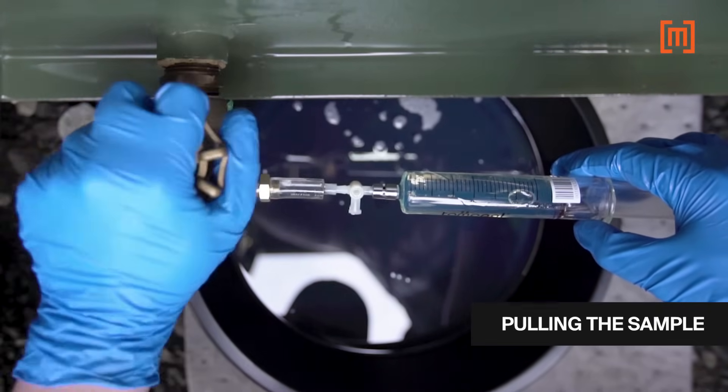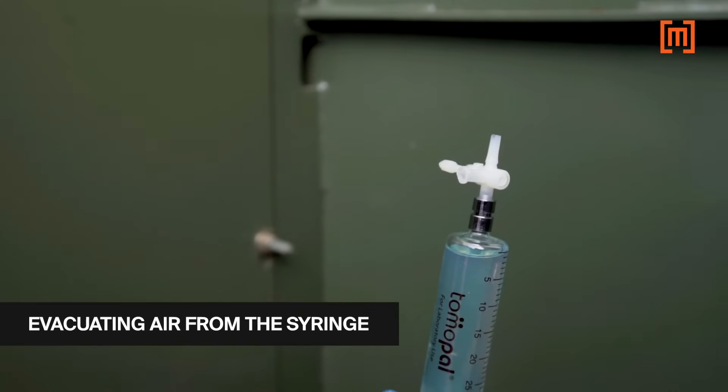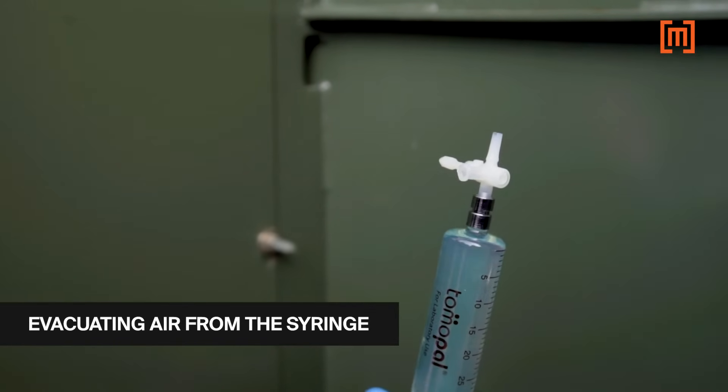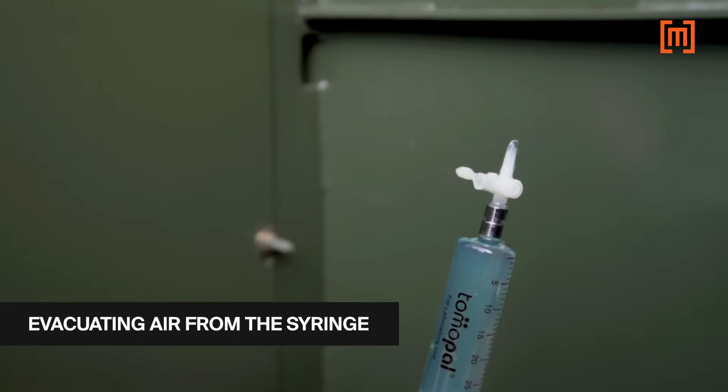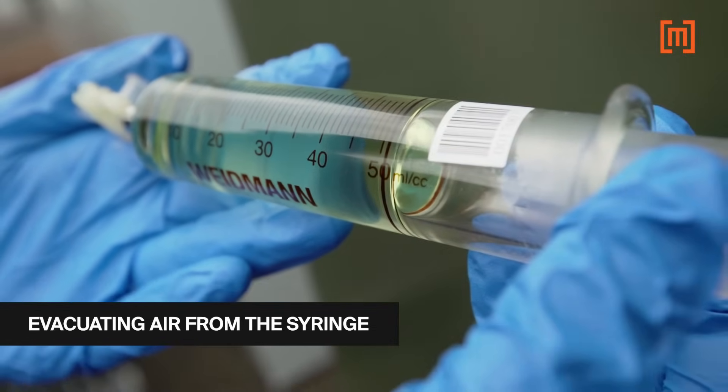After the sample is pulled, the air in the syringe is evacuated. With the syringe in an upright position and the valve closed to either the bleeder or the hose, the plunger is pushed up, forcing the air and a little bit of oil out until the 50 cc mark is reached.